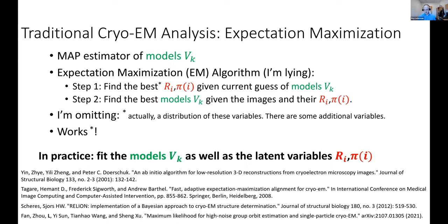At least if you don't have heterogeneity, or if you have very discrete heterogeneity, people got really impressive resolutions using these algorithms. Maybe for us to say that it works, is it also validated? Not just that they got something pretty. Yes, it's validated in the sense that many of these things can be compared to what they do in X-ray crystallography, and they agree pretty well. So it really does work.